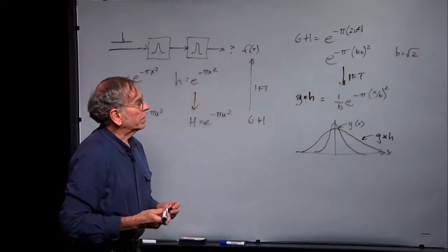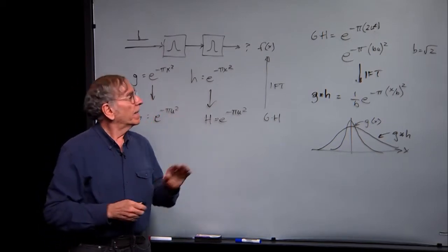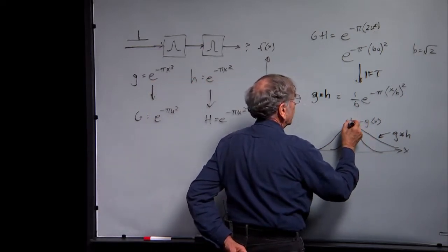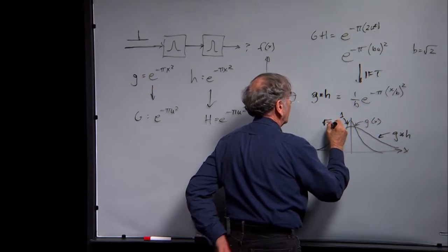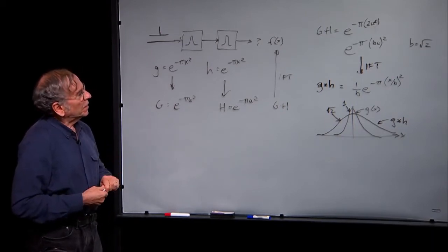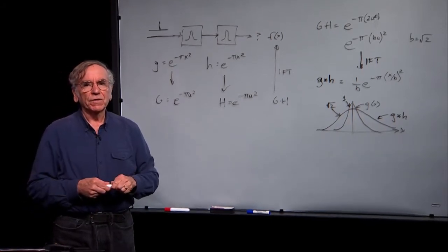The thing that's a little bit counterintuitive about this is that we operated with 2 filters, each with a width of nominally 1 unit. And what we got out was not a signal that was 2 units wide, but it's just the square root of 2 units wide. So if we say that this has a width of 1, then this thing has a width of square root of 2, about 1.4. This is related in a deep way to the whole idea in statistics that variances add. But anyway, this gives you an idea of what repeated filtering might do to a signal and how you can use the things that we know about Fourier transforms to compute a convolution straightforwardly.